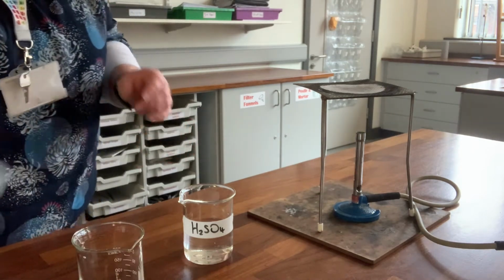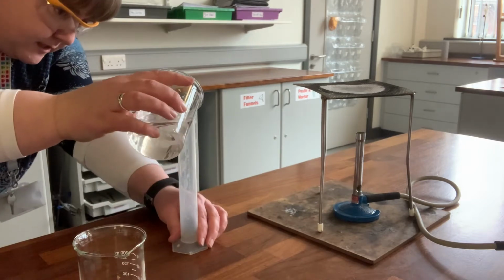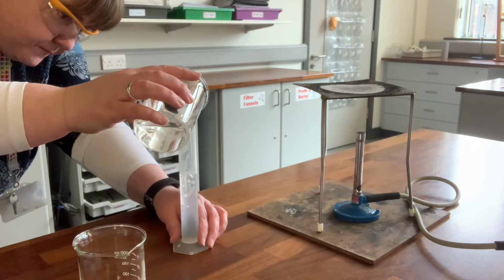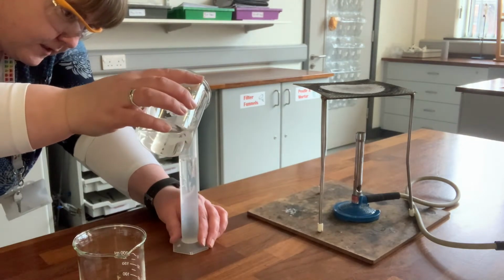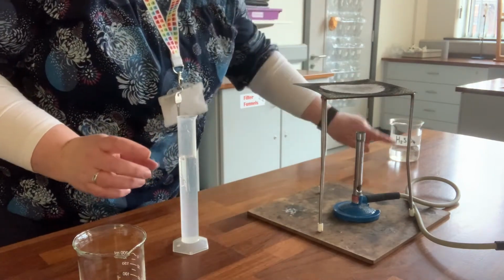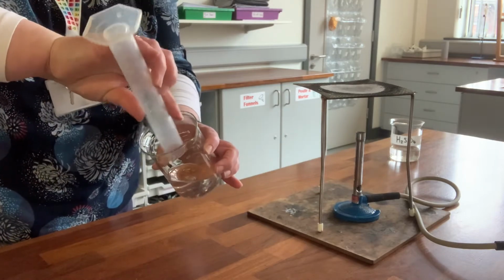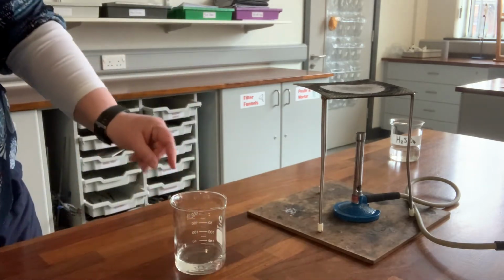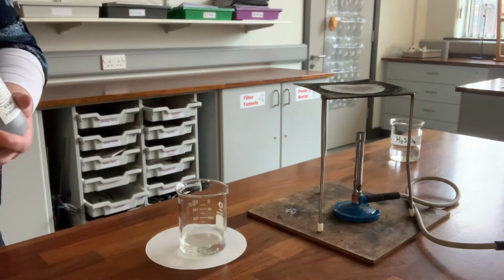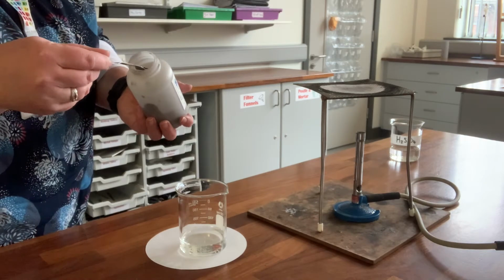So to start with, I'm going to measure 50 centimetres cubed of the sulfuric acid into a separate beaker. Okay, so I'll just leave the sulfuric acid there to remind you that it's colourless, and I'll pour 50 centimetres cubed into the separate beaker. Now, what I will do is put a little piece of white paper underneath the beaker so you can see the colour. So when we add the copper oxide to the acid, we will get a salt plus water.